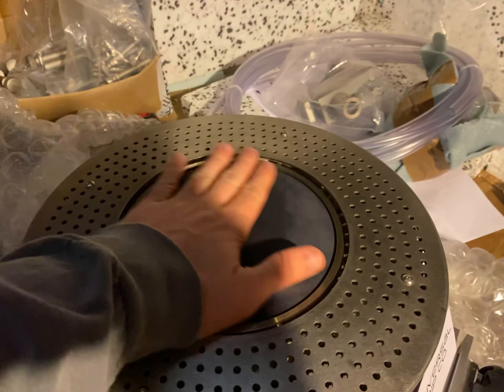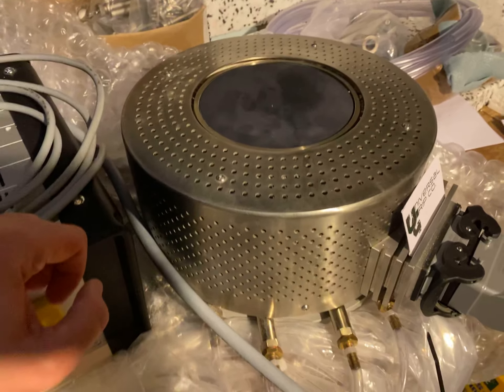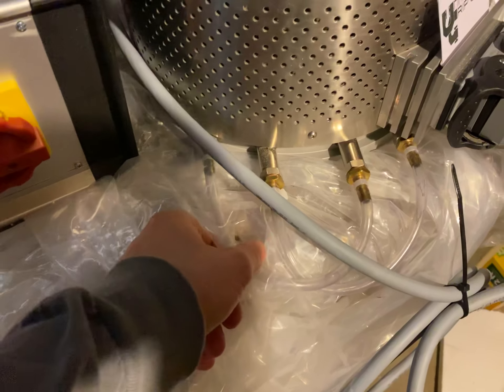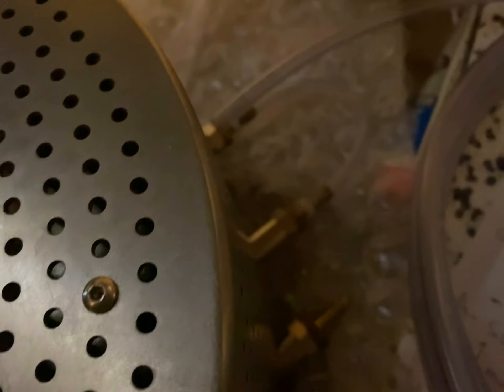The top platen is six inches wide. To control the temperature and maintain some temperature stability, you can run water through the hoses here — you can see the water connections in the back. You can set this up with a circulator, but it's not really necessary; you can just run it with tap water. The hose is set up to your tap, circulates through, and comes out here to drainage.